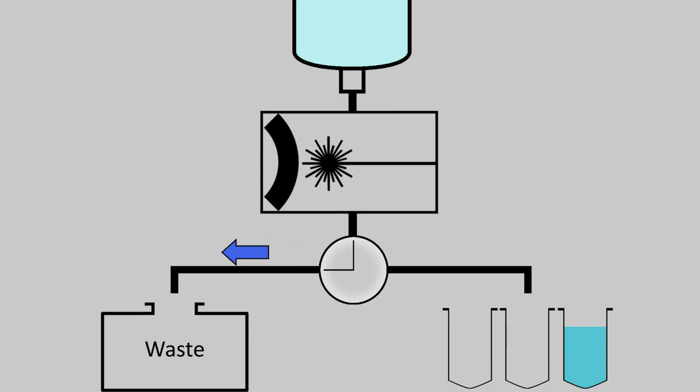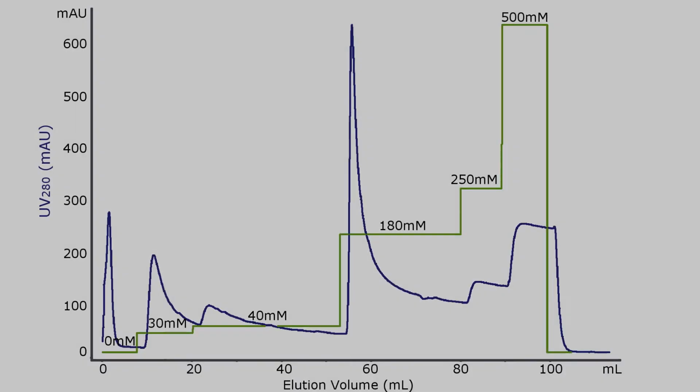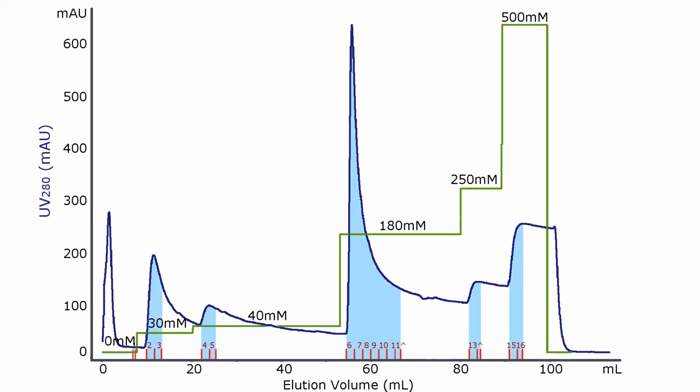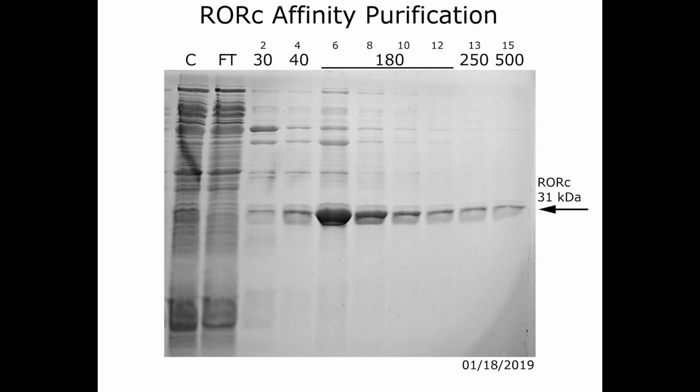The final relevant feature of the FPLC we will be talking about is its ability to collect the sample in a process called fractionation. Simply put, a junction changes the route of your sample to flow into tubes ready for collection. The tubes, known as fractions, fill with sample according to trends we see on a chromatogram. This way, when each fraction corresponding to a peak is run on an SDS-PAGE, we get an accurate representation of what each peak contains.